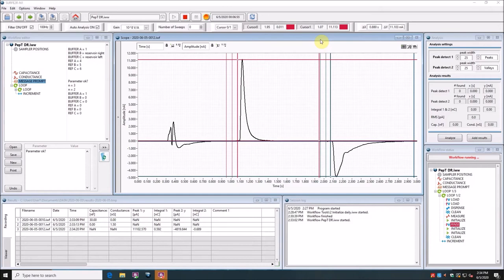The current decays fast due to the rise of membrane potential. At the time point of 2 seconds, the valve switches again to inject non-activating solution and wash off the substrate. The off-peak is recorded, reflecting efflux of protons and peptides through PEPT1.